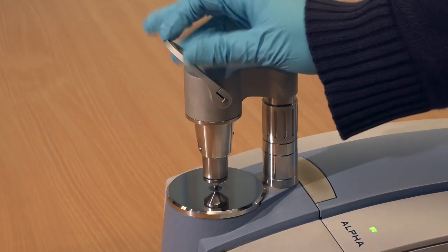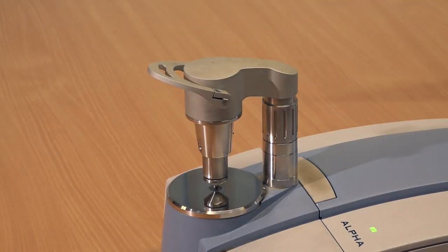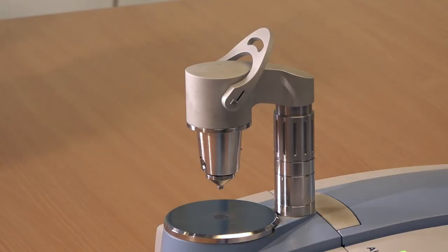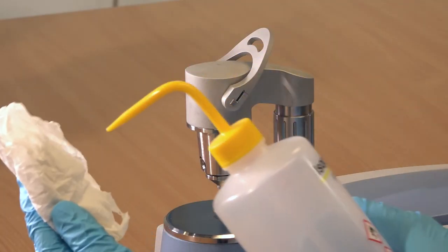Swivel the arm out of the way and clean the diamond surface with IPA on a tissue. IPA is ideal as it evaporates quickly.